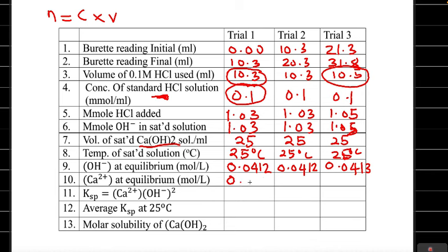This is 0.0206, right? I'm going to repeat it because the volume is 10.3 here, so it's almost going to be the same thing. 0.0206. And I'm not going to bother myself with solving all of this. One solving is enough. So I'll come here and say 0.0206, because the answer may not be exactly that, but it's going to be close to this, because the volume of this guy was high. So for those of us who like following protocol, let me just make you guys happy. Put here to be 7.